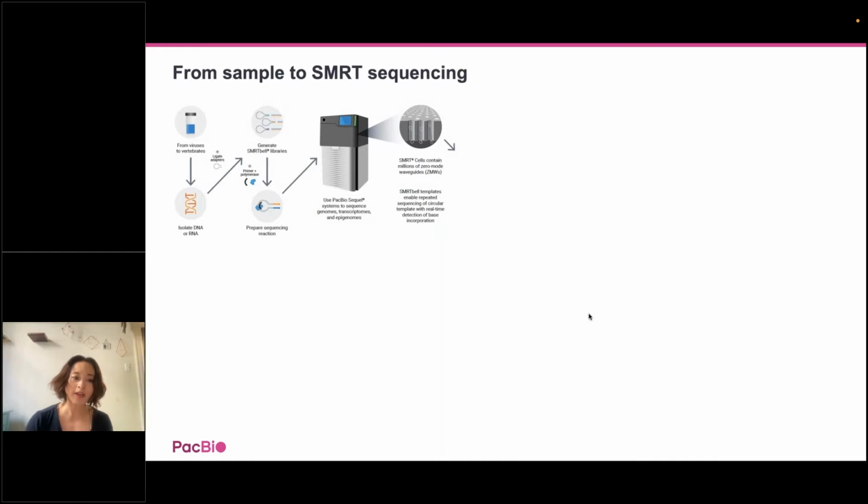I mention this because PacBio has been used not just for AAV vector sequencing, which Don, one of our guest speakers, will talk about, but also for sequencing RNA to look at the transcripts being expressed later in the talk today. People have also used SMRT sequencing for sequencing plasmids.